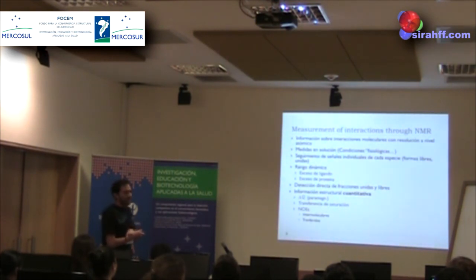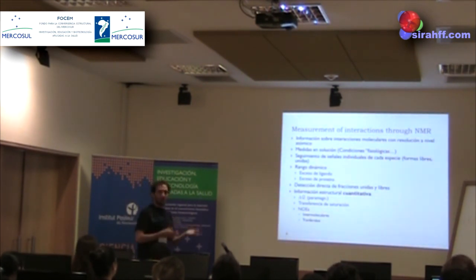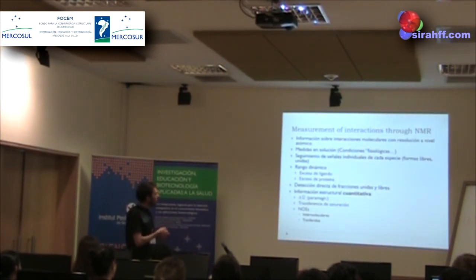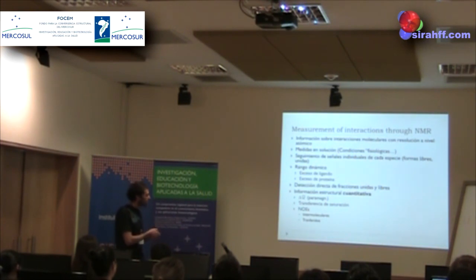Why is it fun to measure interactions using NMR? You get information on molecular interactions with atomic level resolution. You do the measurement in solution, under physiological conditions, at physiological pH and salt concentration. You can follow individual signals for each species, which are complexes, whatever species you want. You can work on a high dynamic range, from micromolar to millimolar concentrations, with signals across the whole range.